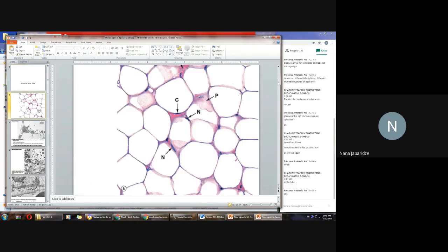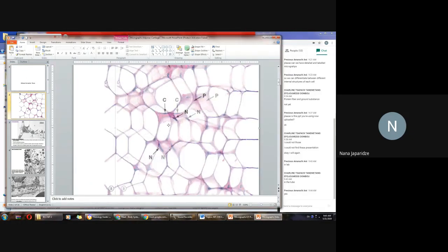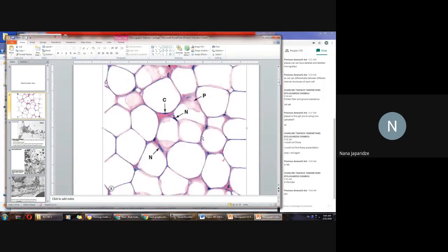And here the situation is much easier because cells of this connective tissue are easily identifiable. When you have a set of micrographs together, adipose tissue is really easy to identify. But this is white adipose tissue. I'm talking about the white adipose tissue.